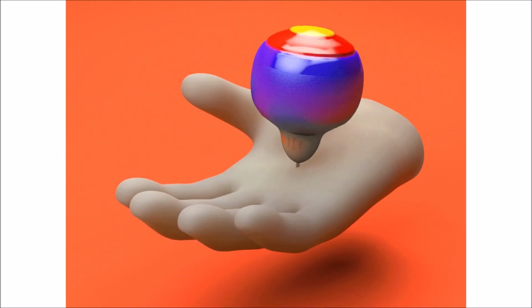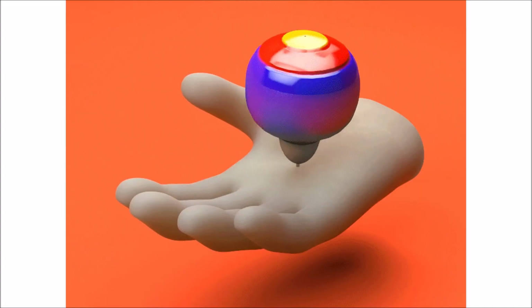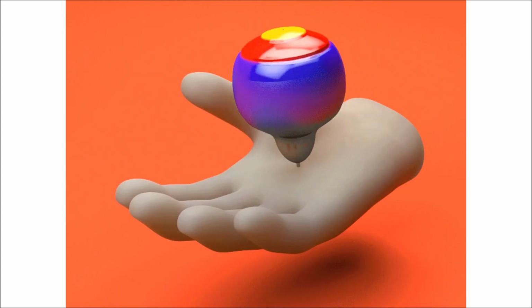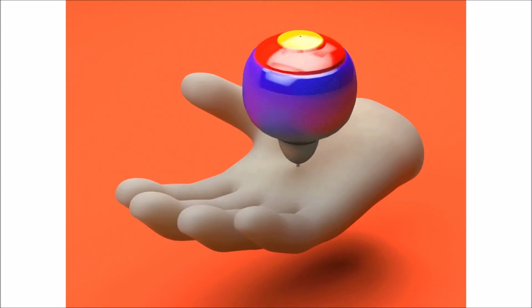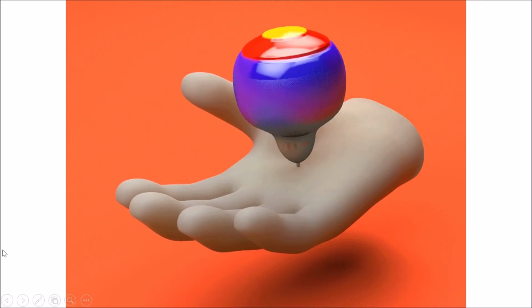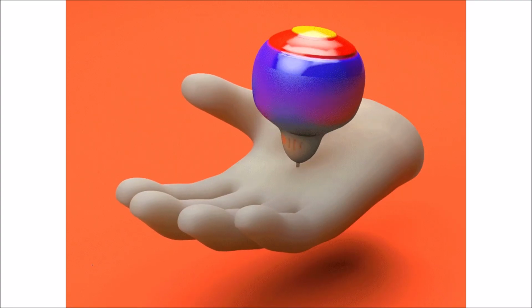So any nuclei, or nucleus in particular, whenever it is present in the presence of a magnetic field, it will rotate like this. It will undergo precessional movement. Precessional means rotation like this. A top is rotating, and this movement is called precession.